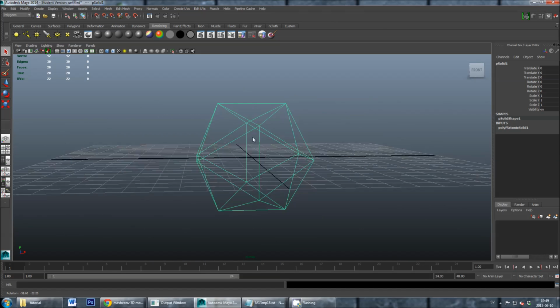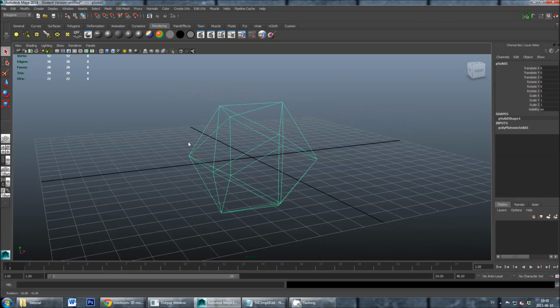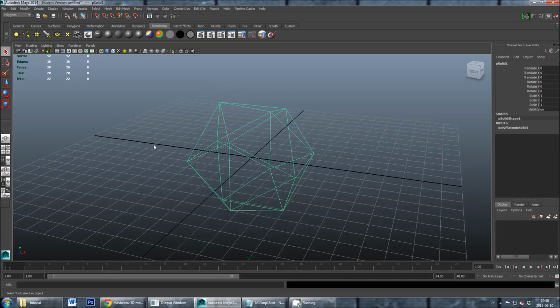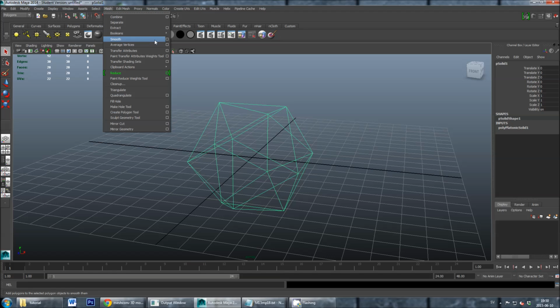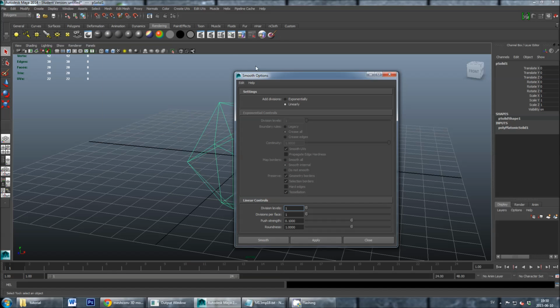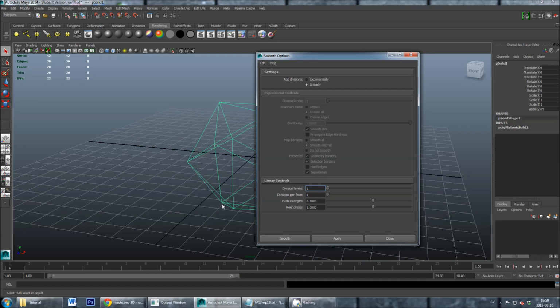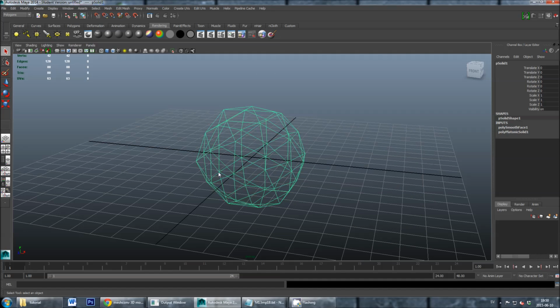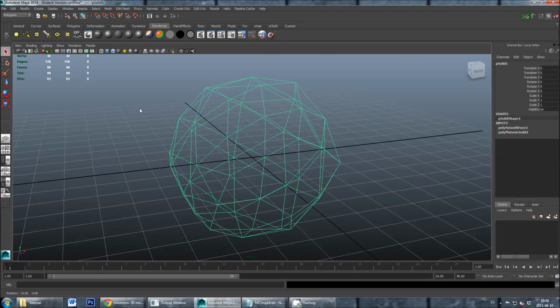So this is an icosahedron. It's a simple spherical mesh with 30 edges. So this is a bit too low edge count for us for a design from an M13 based scaffold. So I will increase the complexity of this mesh by using the feature Smooth. And again, I will press the little square for extra options. So here I will use the options Linear and a division level of 1. And with the icosahedron mesh selected, I will press Smooth. Now, this has increased the complexity of the mesh into 120 edges, which is appropriate for us.